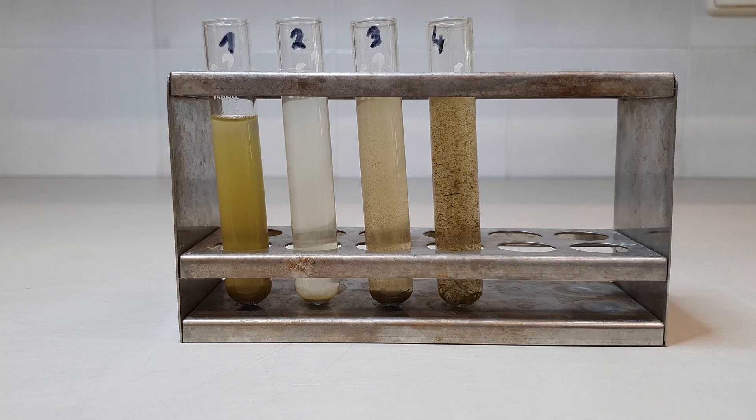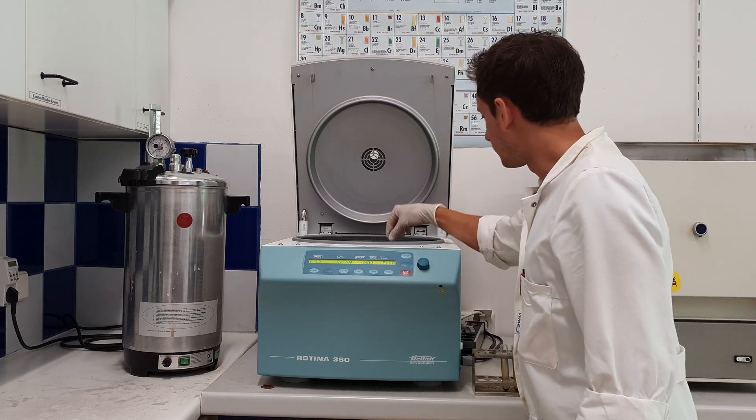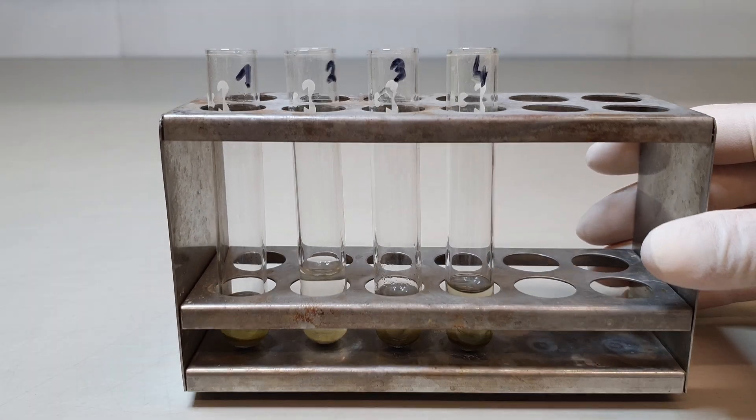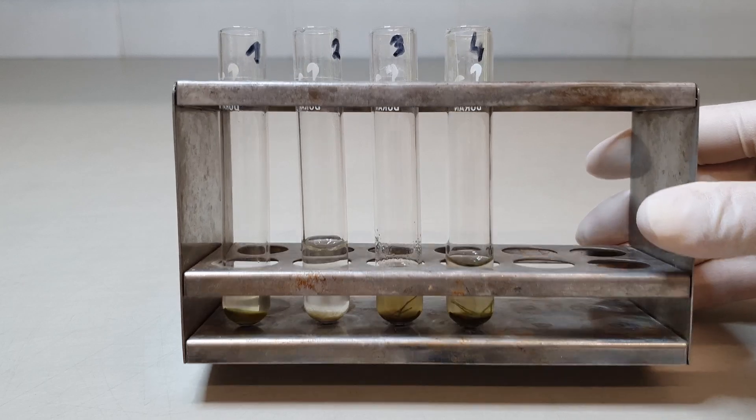If the sample is not sufficiently concentrated, the subsample can be further concentrated by decantation or centrifugation and addition of more sampled material. The goal is to obtain 2–3 ml of concentrated diatom suspension to start the cleaning process.